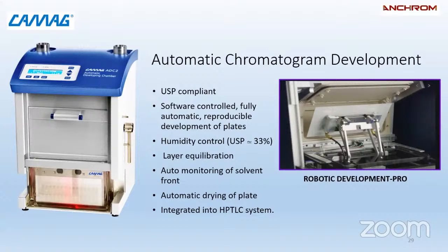Because suppose if I do not have control on humidity and I'm performing one particular analysis, because of the variation in the humidity level, if I'm doing one particular analysis in Mumbai, I may get a different result if I am performing the same analysis of the same sample in Gujarat, because the result depends on humidity.